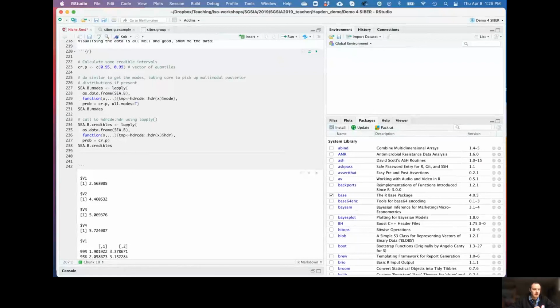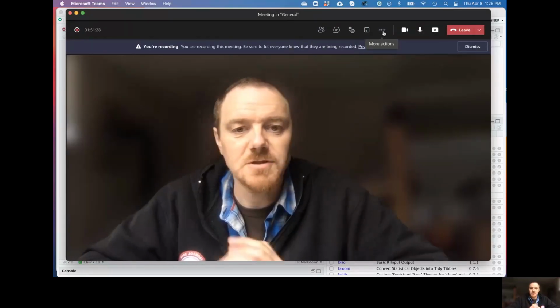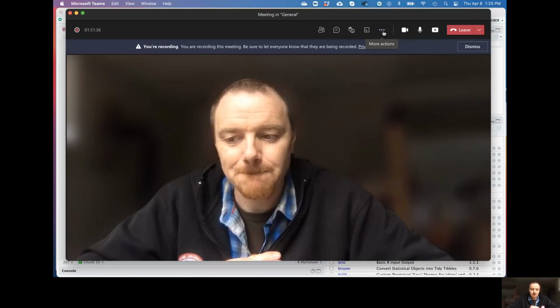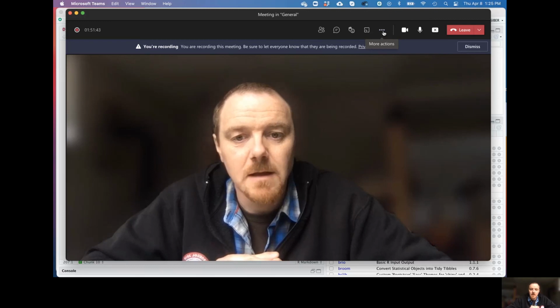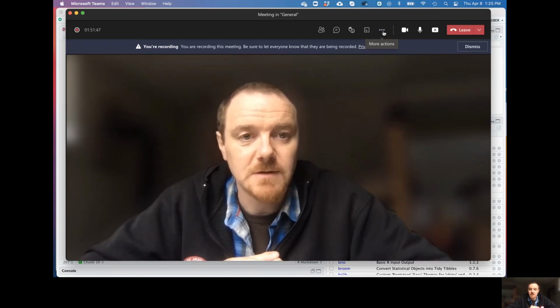Okie dokie. I want to bring this back up here. And that pretty much is SIBER for calculating the isotopic niche. It's pretty easy, pretty straightforward, and it's cool data. So in the next little video, we're going to flip that around. It's almost the exact same steps, but it will give us those food web metrics, or the Layman metrics that we discussed in the lectures.